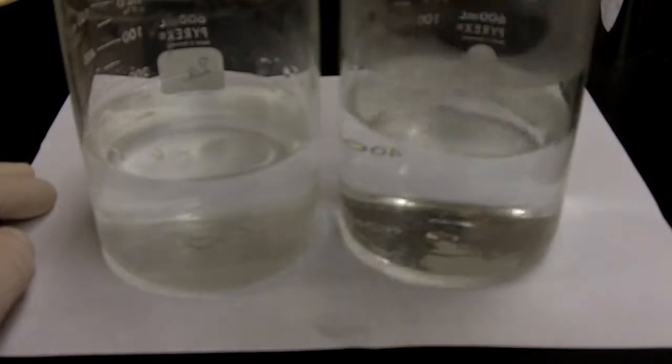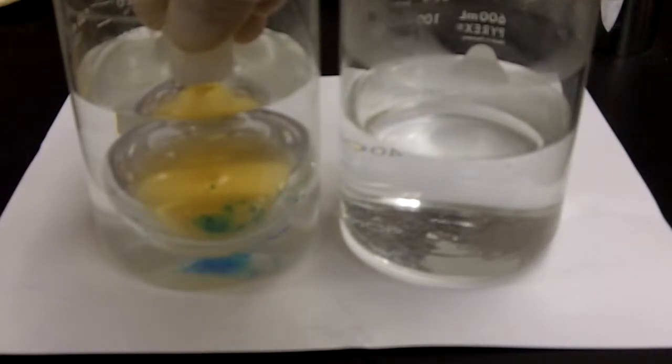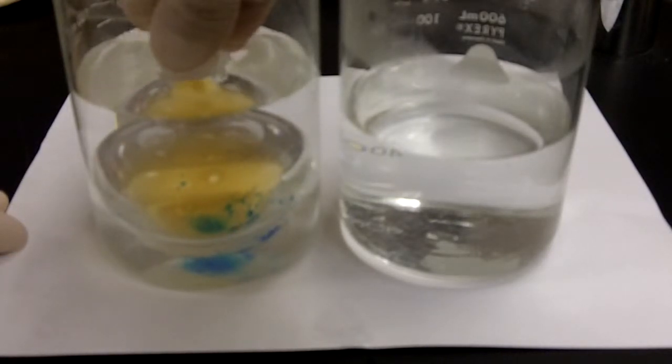Moving back over to the cold water. And back again to hot.